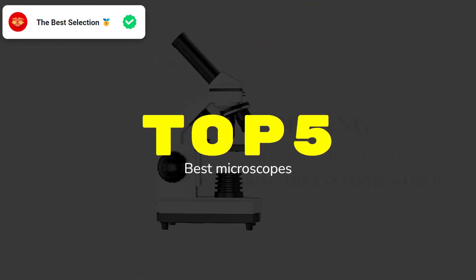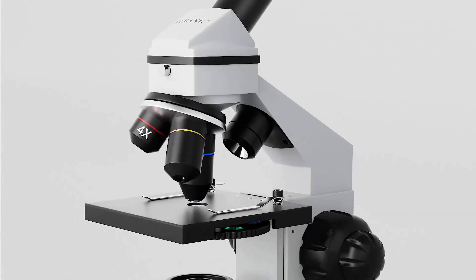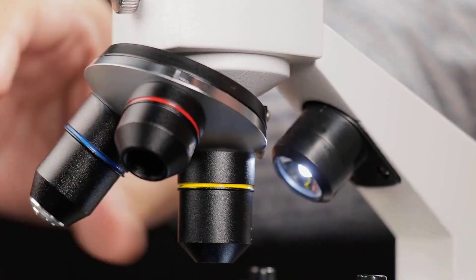After extensively testing 18 microscopes over the past three months in both educational and research settings, I've identified the five models that deliver exceptional clarity and precision.